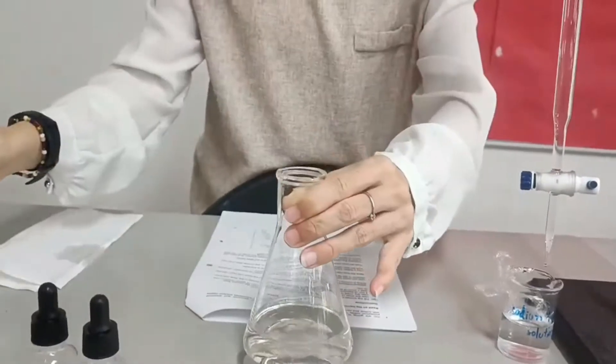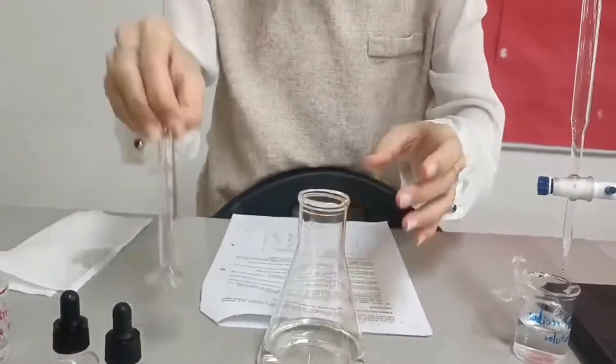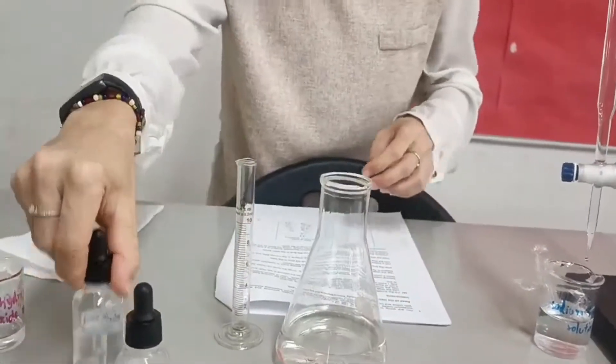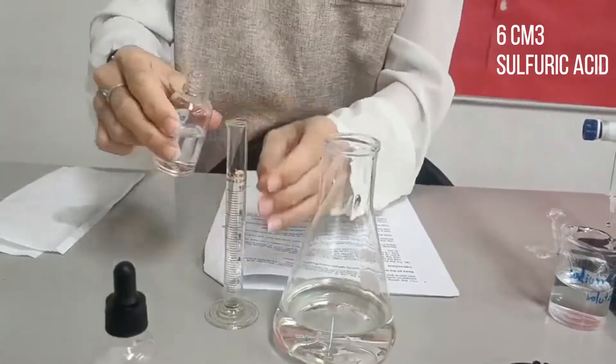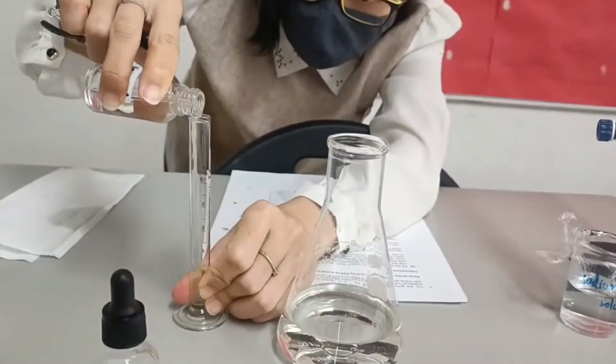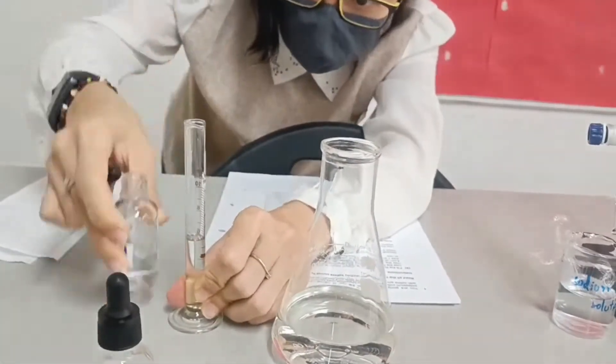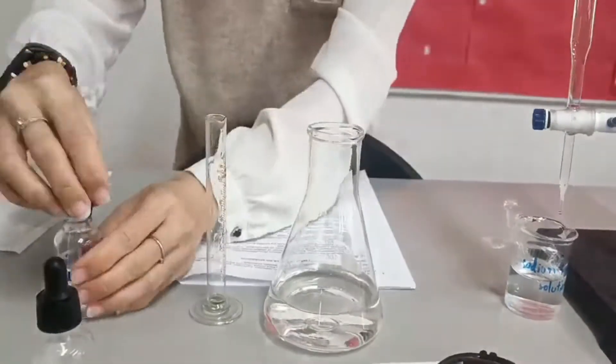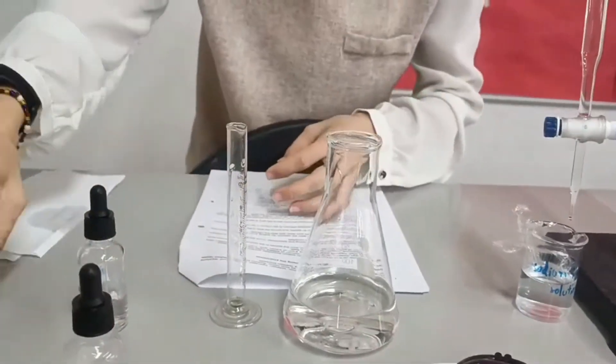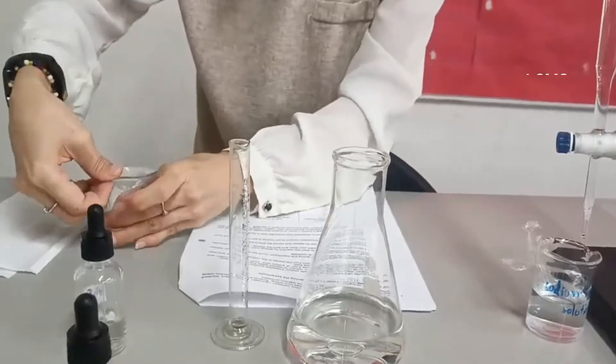And then use the small measuring cylinder to measure 6 ml of sulfuric acid. Also, starch solution, 1 ml.